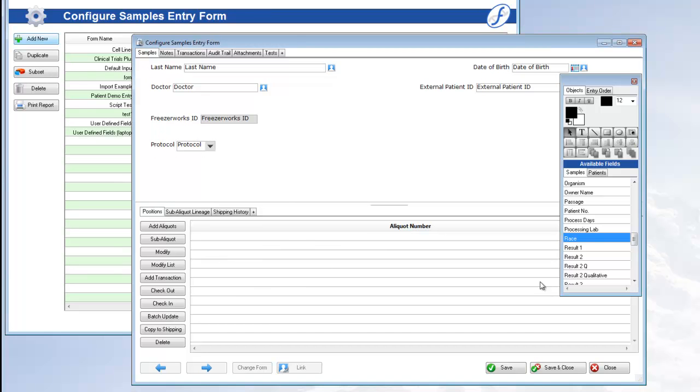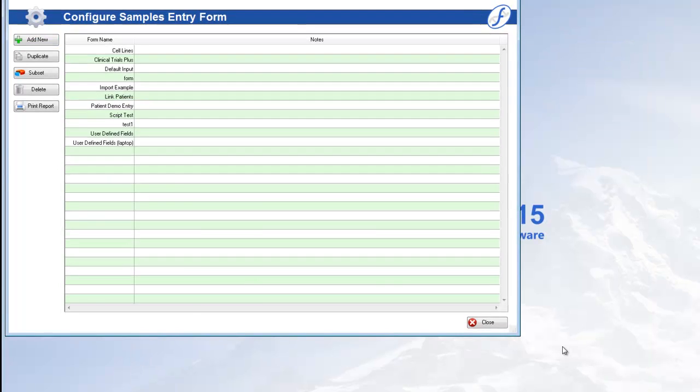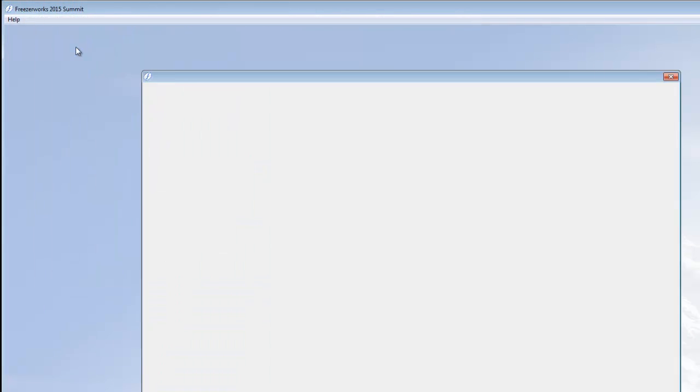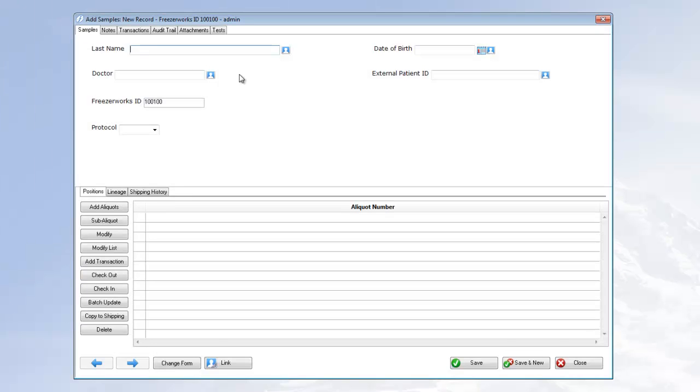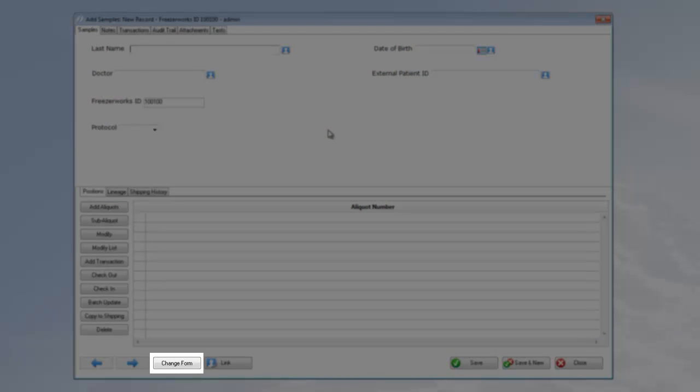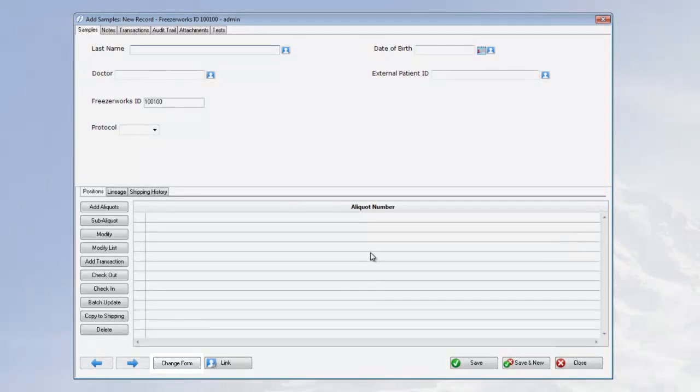Now save and close out of samples entry and click Sample Management Add New Samples. You can also go to the list view and open an existing sample. Once the form opens, if necessary, you might need to click Change Form in order to select the entry form that you place the patient fields on.